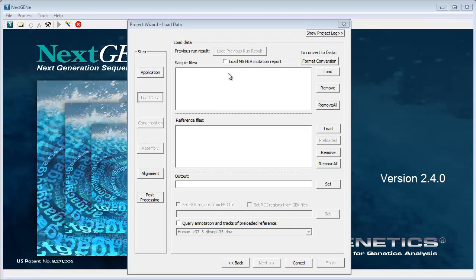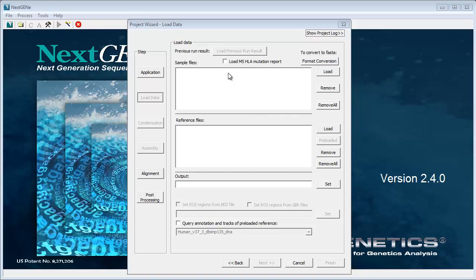If you've used Mutation Surveyor's HLA tool to analyze Sanger electropherograms, the Mutation Surveyor output can be processed by NexGene by selecting the Load MS HLA Mutation Report option and loading Mutation Surveyor's HLA.dat file in the sample files field.